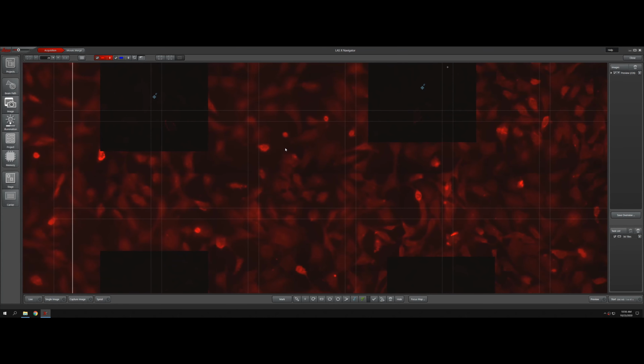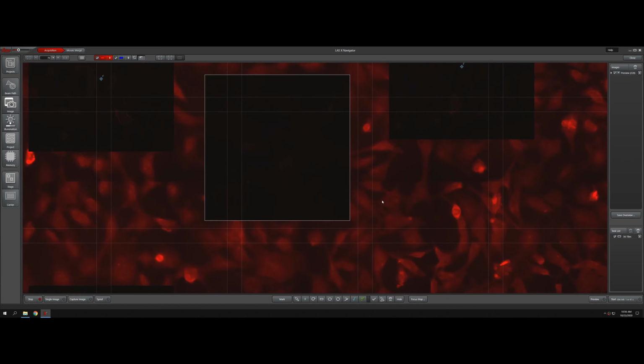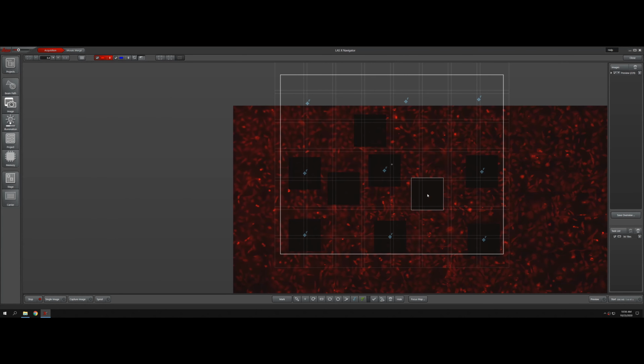But before that, if you double click at any point of this, oh, we're not live, sorry. Okay, when you go live, you can click, zoom in on any point.